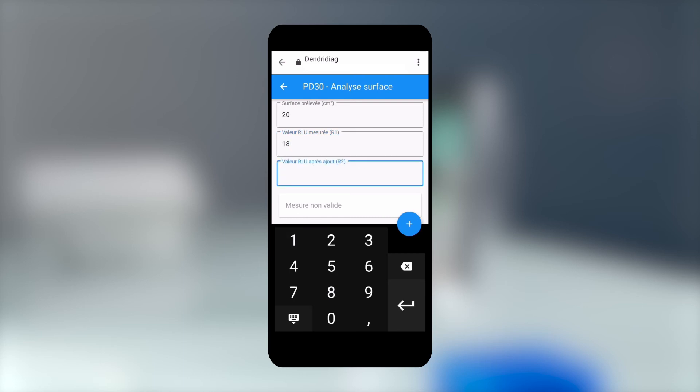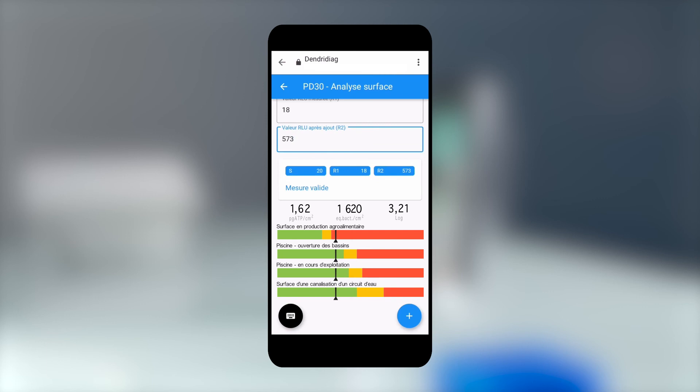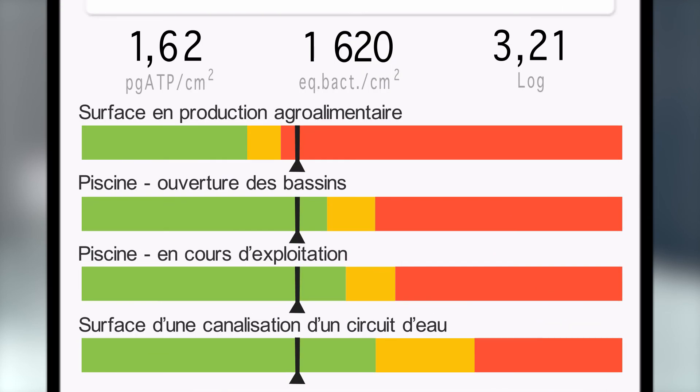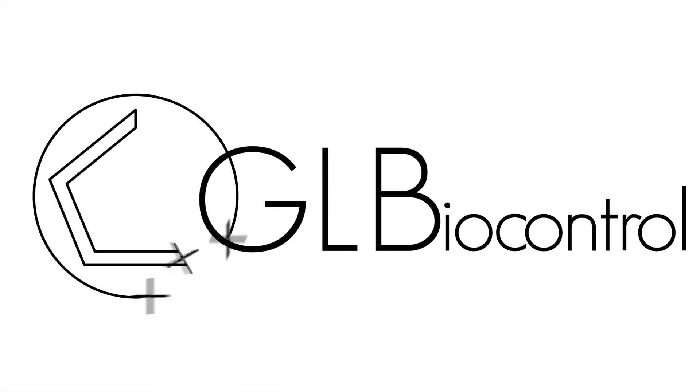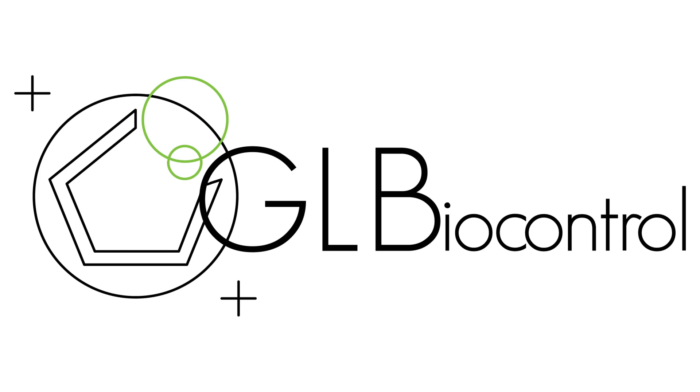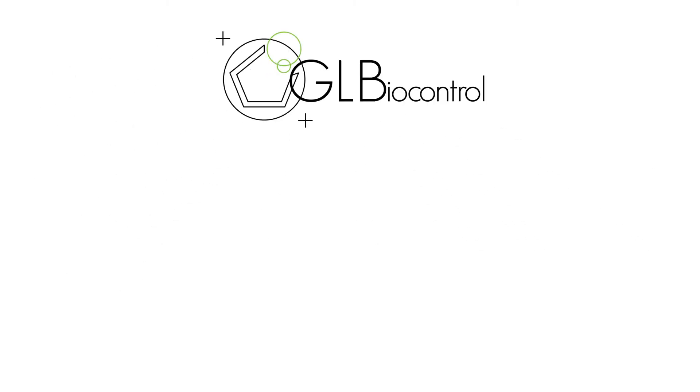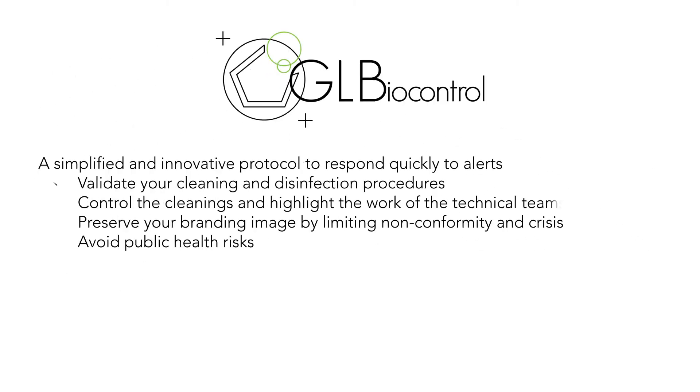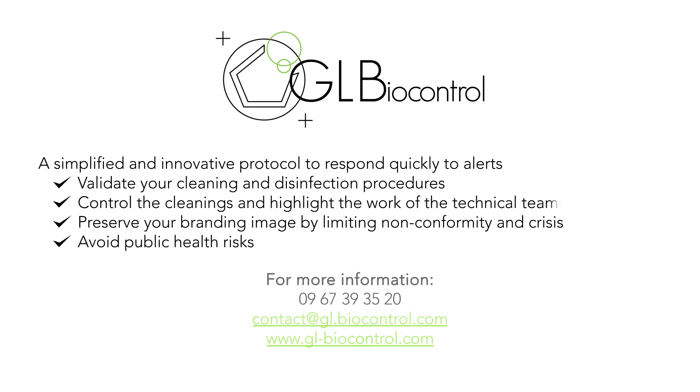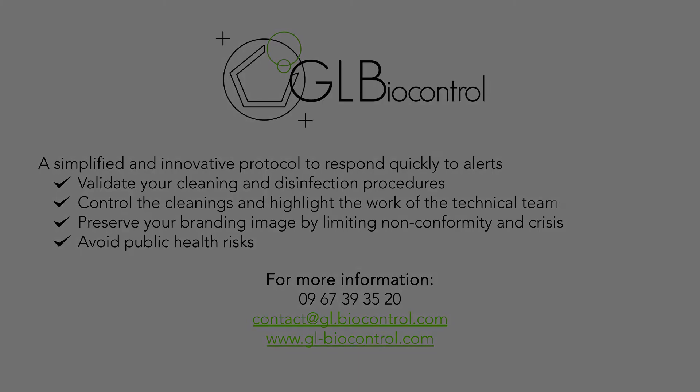The app specifies the quantity of bacteria on your surface. Thanks to a color code, you are informed if a corrective action is required.